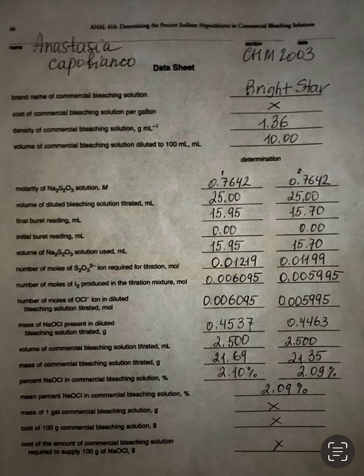In order to find the number of moles of thiosulfate ions, we multiply our molarity by the volume of thiosulfate solution titrated, in liters, not milliliters, in liters.